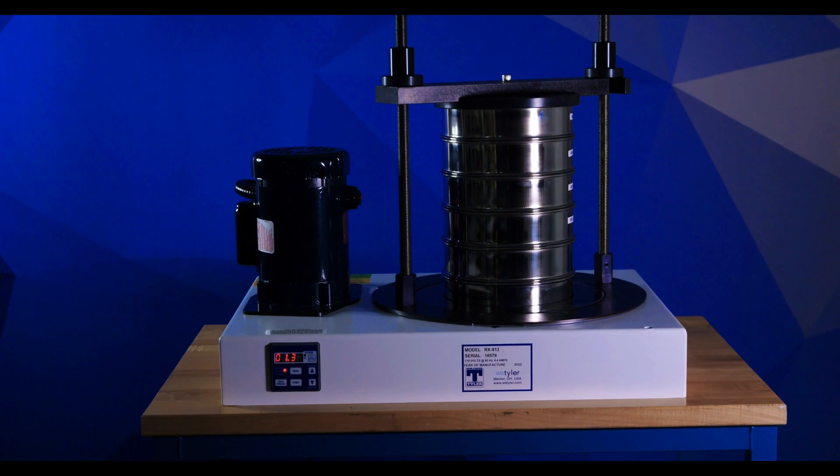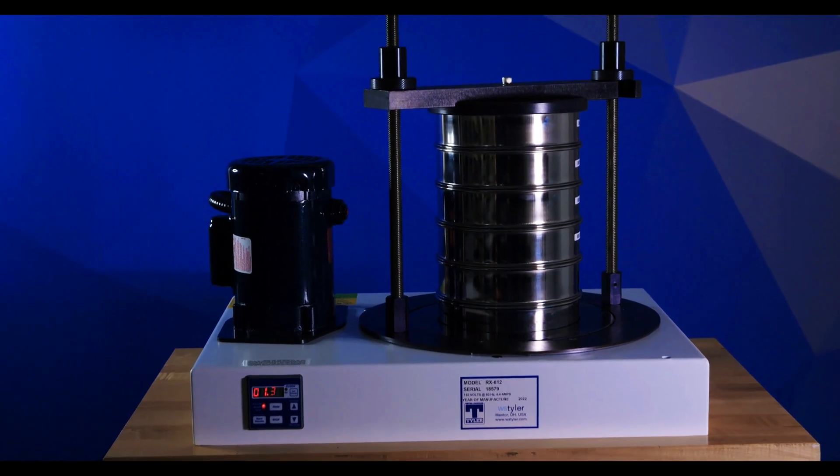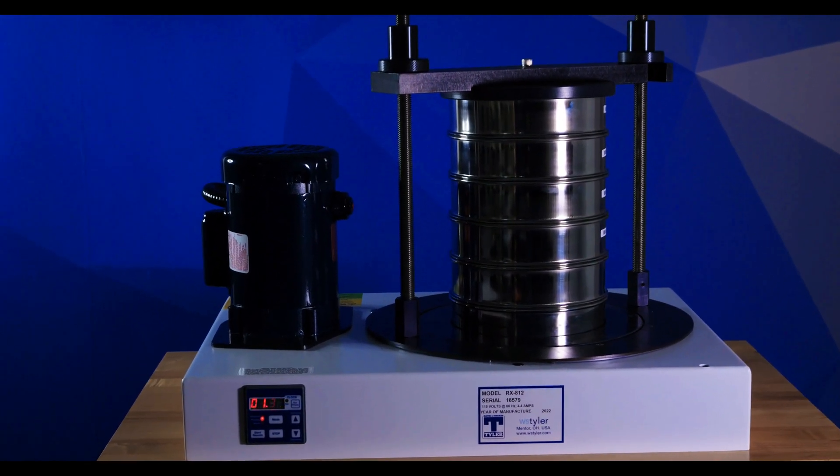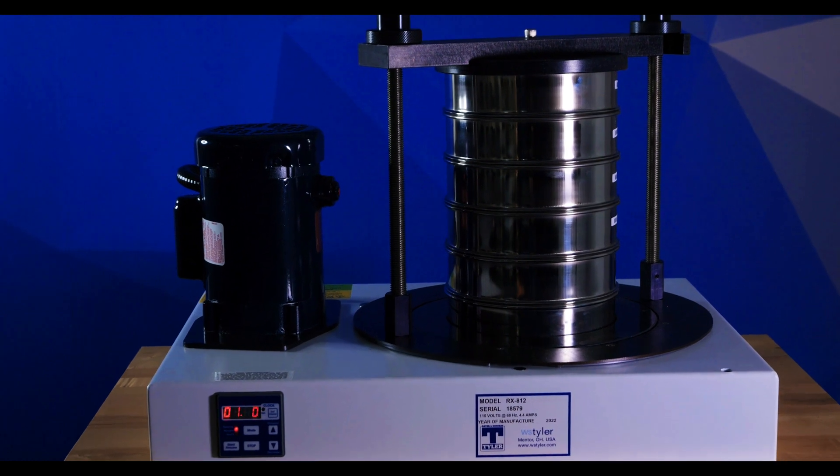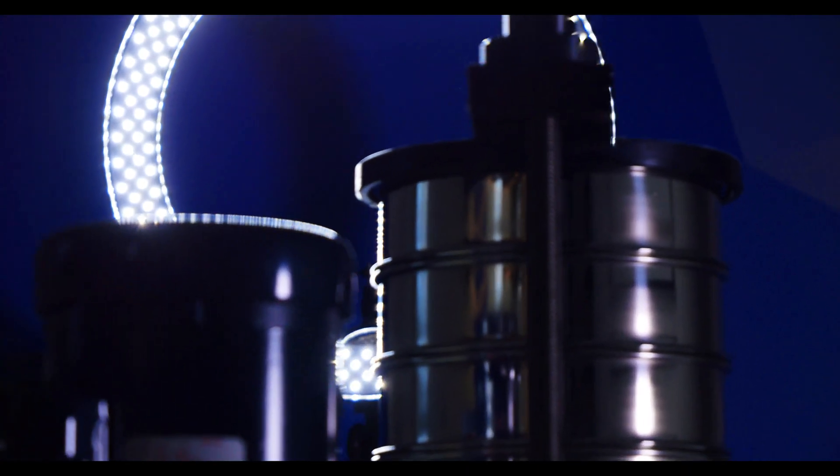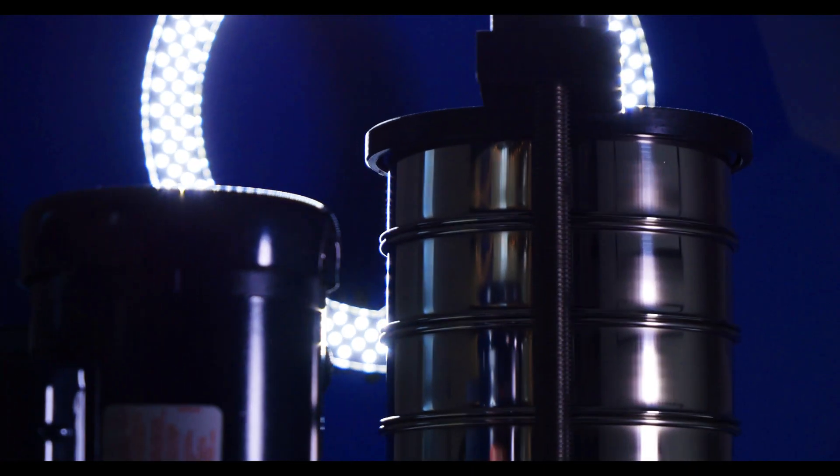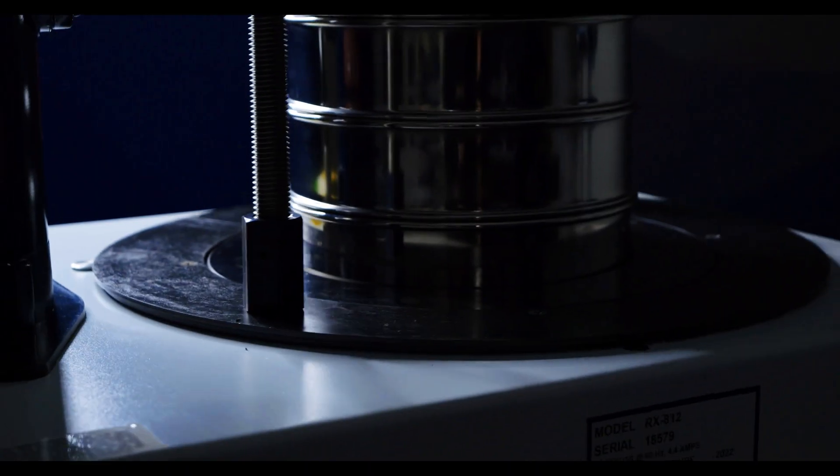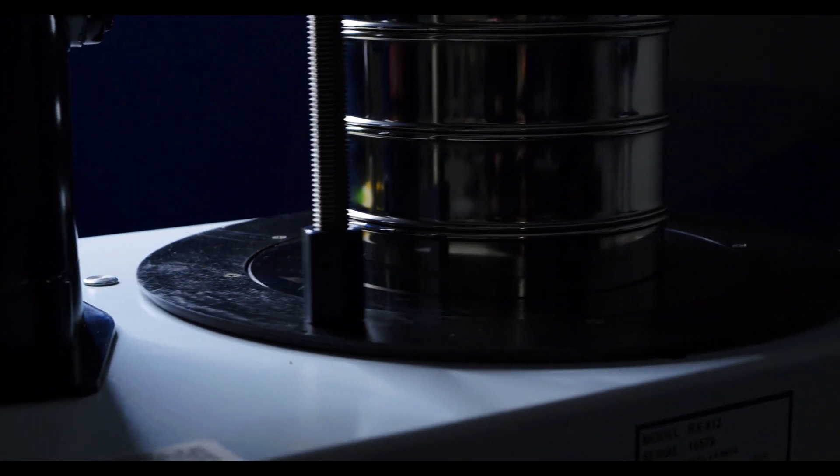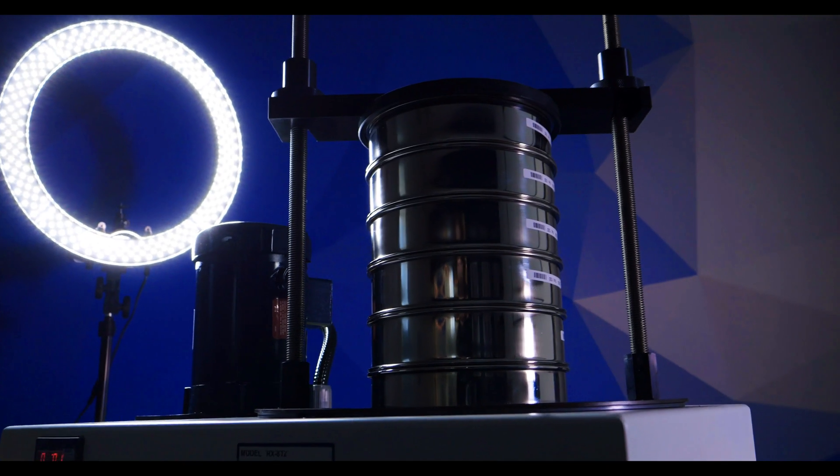The W.S. Tyler ROTAP RX-812 is a straightforward sieve shaker that relies on a singular mechanical orbital motion. This entails the sieve stack rotating in a circular motion without the brute force tapping that occurs with other ROTAP mechanical sieve shakers.